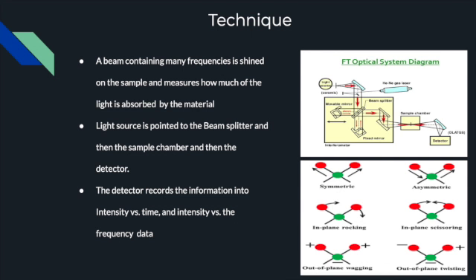After hitting the sample, the beam causes a state of excitement at a molecular level. As you can see in the image on the right bottom, there are 6 ways the molecules can vibrate. Some of the advantages of the spectrometer are that the time taken to determine the composition is very minimal, and the mechanics of the instrument itself is very simple, with only one continuously moving part, the movable mirror.